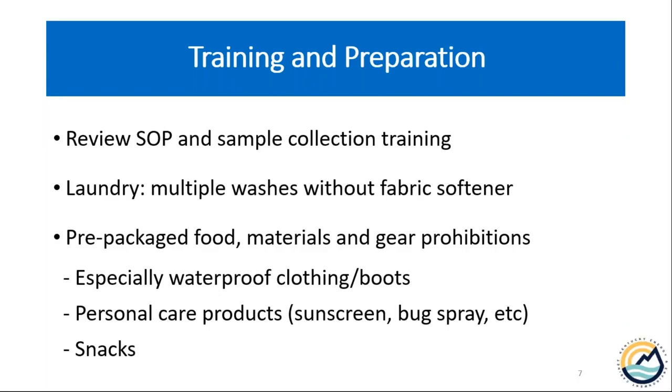We also need to be aware of prepackaged food and materials and gear that are prohibited, especially waterproof clothing and boots, things that we would normally have in the field with us for any other kind of field work, as well as personal care products such as sunscreen and bug spray, and then snacks that come prepackaged in various types of wrappers.